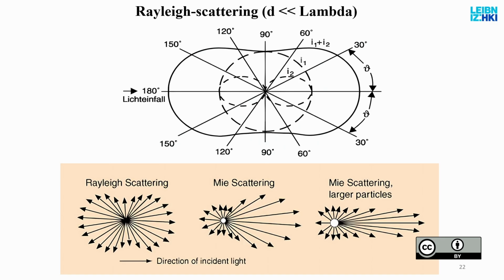And this is what the lenses do. They don't mean it, but this is just how optics works. And we try to compensate for them. But as an image analyst, you have to be aware of them because you have to compensate for them if the microscope is not compensating. And when you are a microbiologist, when you do your experiments, you have to be also aware that this is a possibility when you analyze your images.